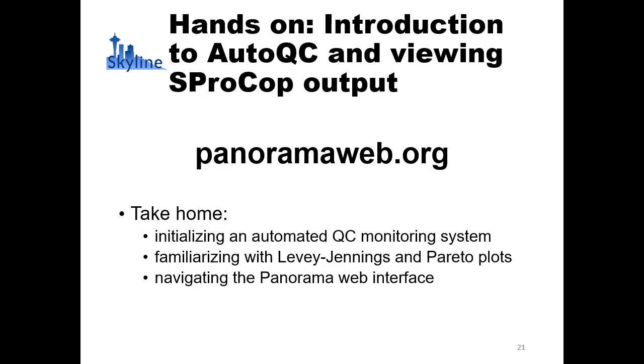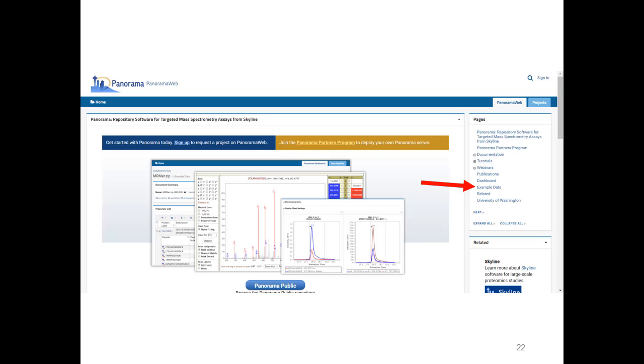So you guys are already pros and you're already done with that last one because Vigisha got you all up to speed on navigating Panorama. If you're playing along, I'm going to the panoramaweb.org website, and on the right-hand side, there's something called example data.